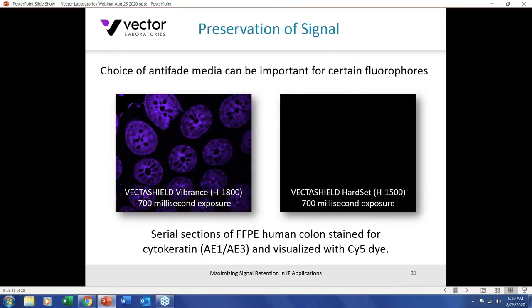However, the choice may differ for different fluorophores. Comparing the same VectaShield Vibrance and VectaShield Hard Set for a CY5 far-red dye, VectaShield Vibrance retains the signal significantly better at this exposure rate than VectaShield Hard Set. So be aware that the choice of mounting media can be important for certain fluorophores.